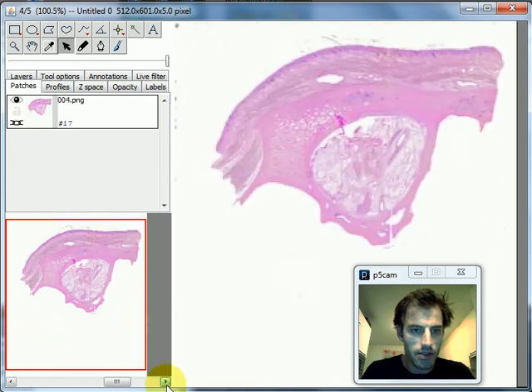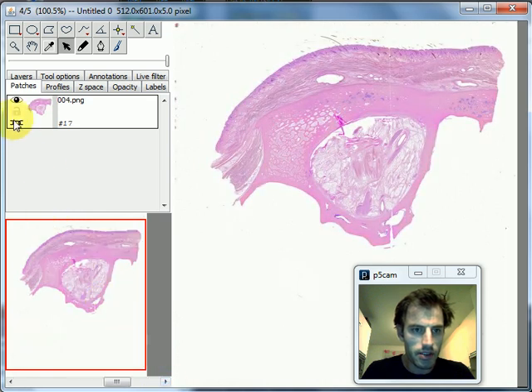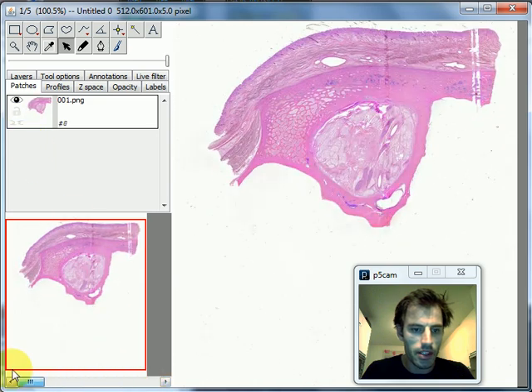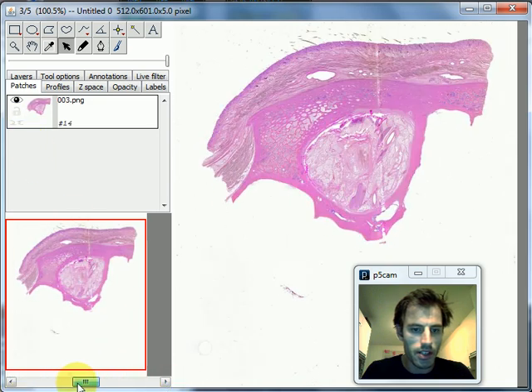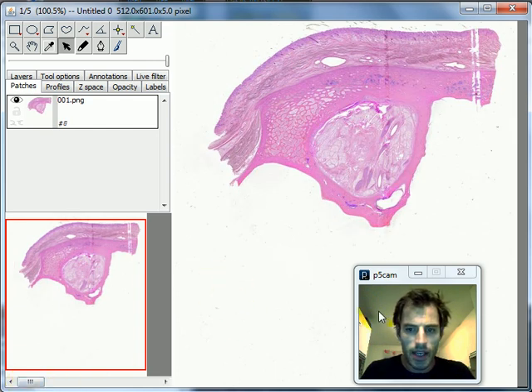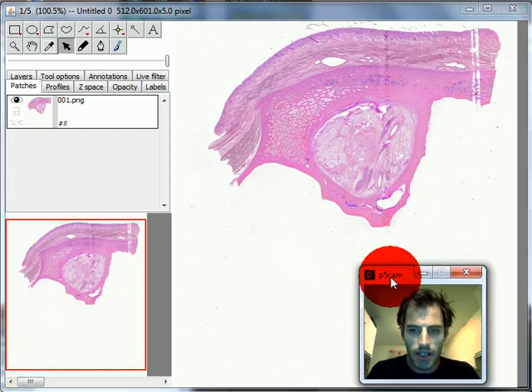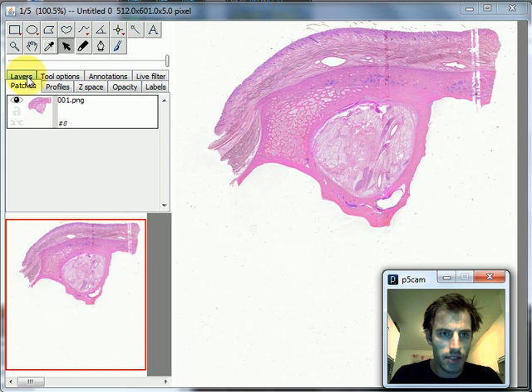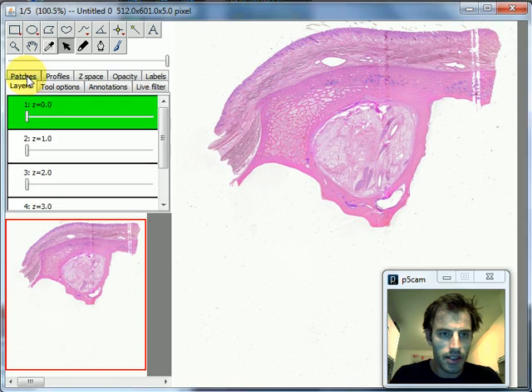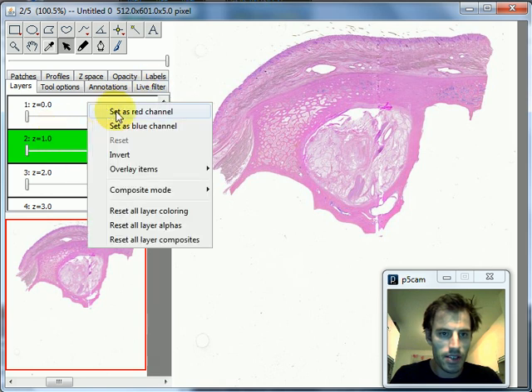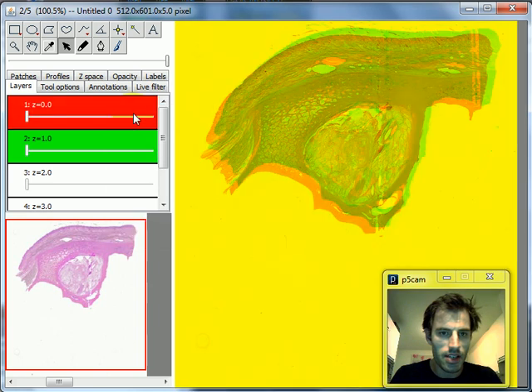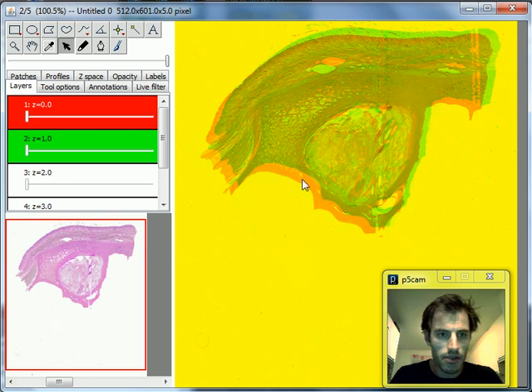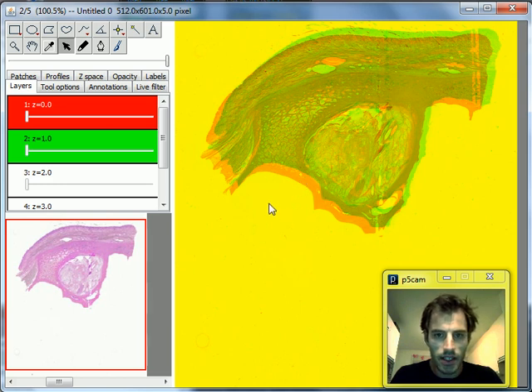In this registration process you can do this while you're working or do them for all five right now. This is how we go to and fro through our slice stack. What I'm going to do now is go to my layers, go to the second slice, and then right-click on the previous slice and say 'Set as red channel'. So now I get this very easy to use red-green overlay over here.